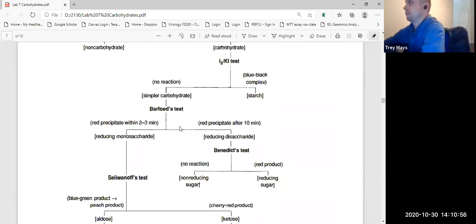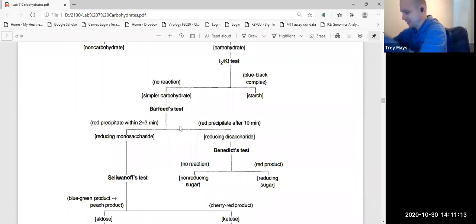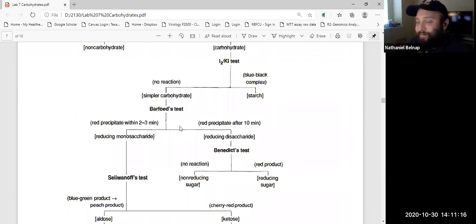Yeah. And also, he said something about Googling it and seeing what it should be in theory, not just based on this video. Yes, Trey, I know. Because xylose is a monosaccharide, but it tested out as a disaccharide. Exactly. So it could just be an error of the lab, right? Not everything's going to work perfectly. And trust me, if any of y'all are going into research, you know that things don't always work out perfectly every time for whatever reason. It was just bad luck that day, right? And it is 2020, so it's been a bad year anyway, right?